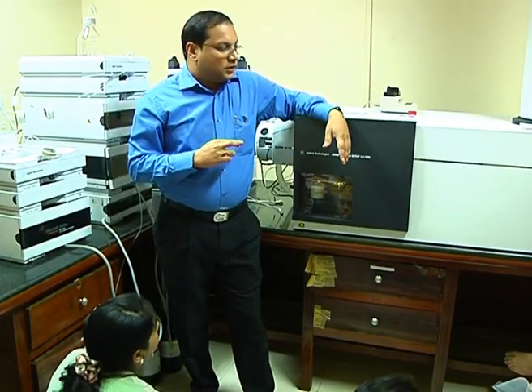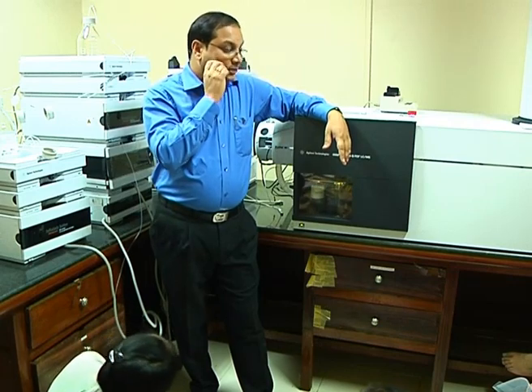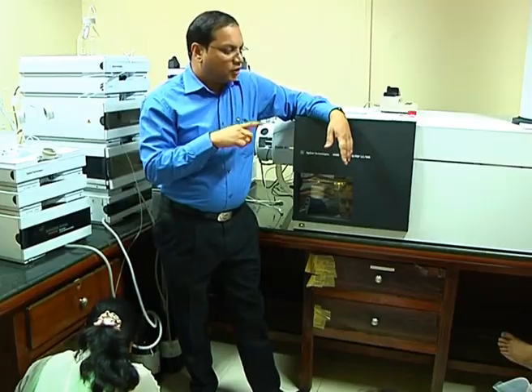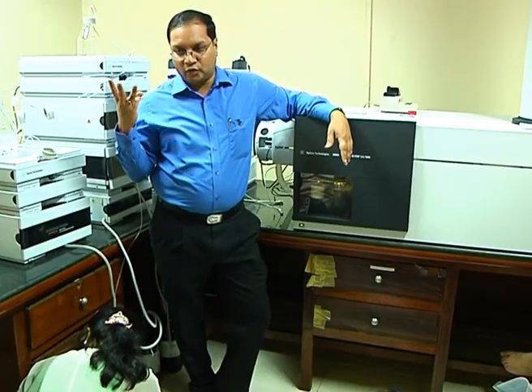So as a functionality, now as an applicability, how do we apply that? Broadly, the Q-TOF can be run in three different modes.